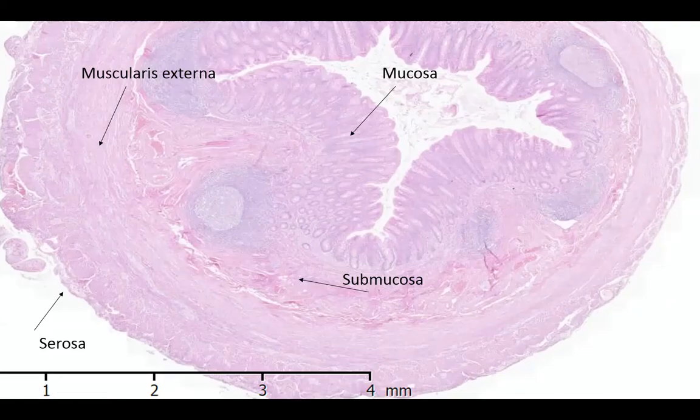As we microscopically zoom in farther, we can see in great detail the components of the appendix cross-section. The appendix is found in the right lower quadrant of the abdominal region. It is connected to the cecum and is typically 9 centimeters long. This is a pediatric appendix being shown here, so it is a bit smaller than what is expected in the adult.